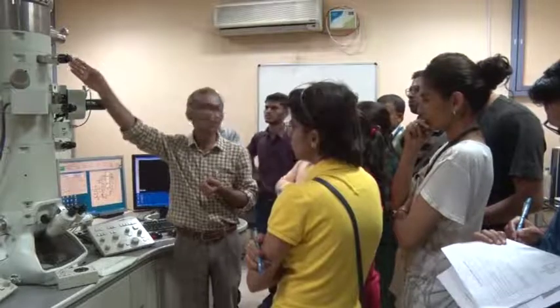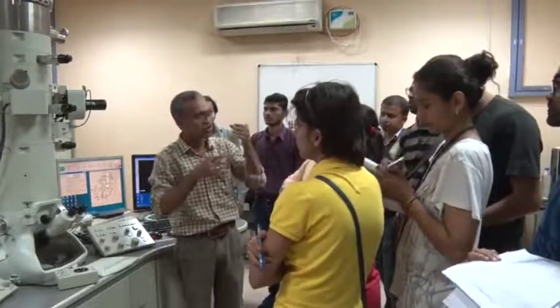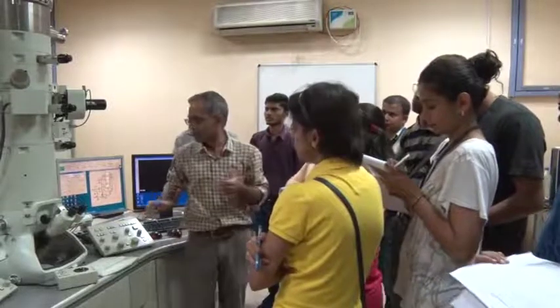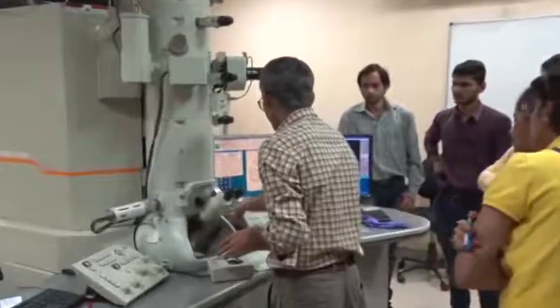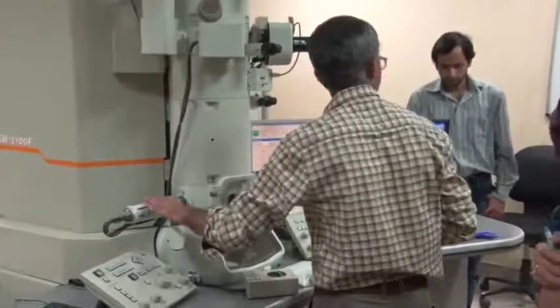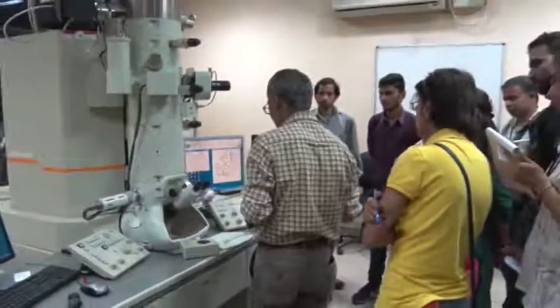And this is the condenser aperture. With that we can control the convergence angle or the intensity of the beam. Okay. And then these are the two STEM detectors. This is the bright field detector and this is the dark field detector. So that will be explained by Professor Benjamin lastly.